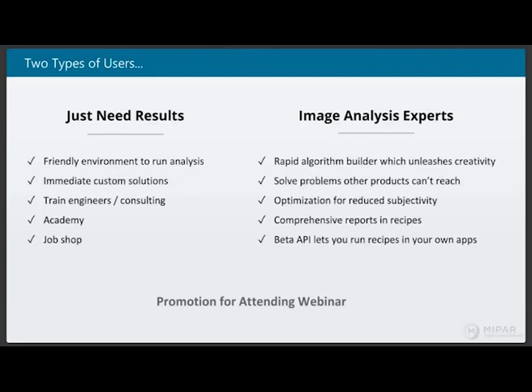It's simply a set of pixels to the software, and it's all about coming up with an algorithm that teaches the computer how to recognize the features that you recognize as a human expert. So we have analyzed many TEM images. The format is not a problem to us. We open over 150 different formats, including proprietary ones from different microscope manufacturers.